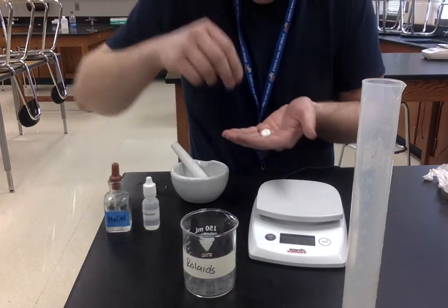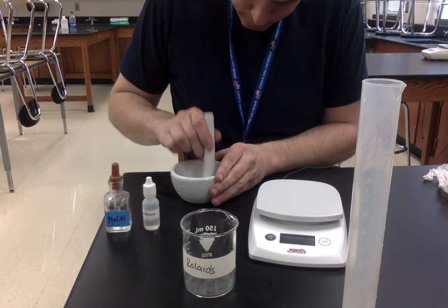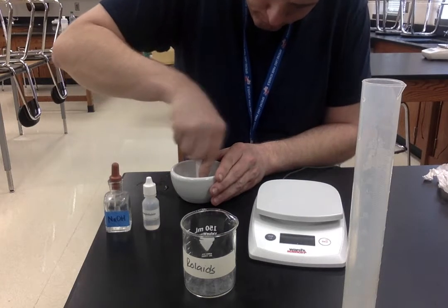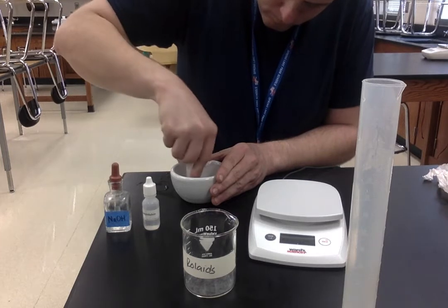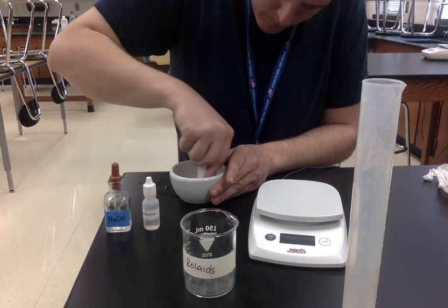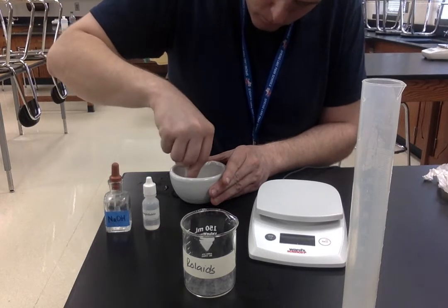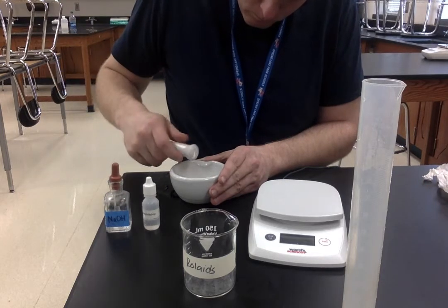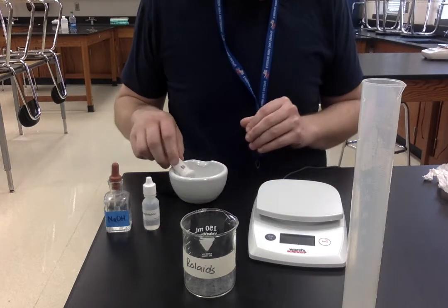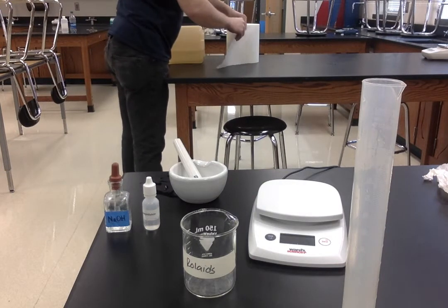I'm going to grab that tablet — I'm on my last one, so hopefully I get this in one try. I'm going to put it in here and crush it up. First let me get a piece of paper, then I'll put that crushed-up tablet on the paper on the scale.